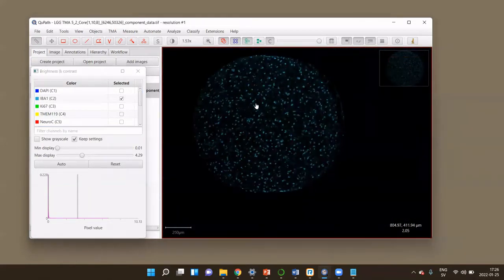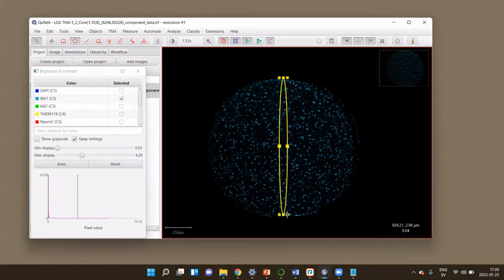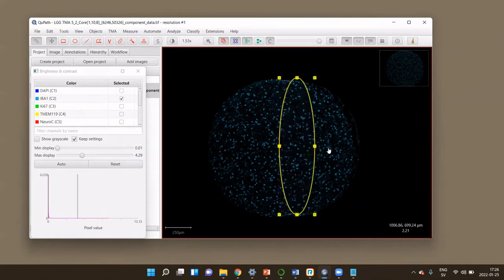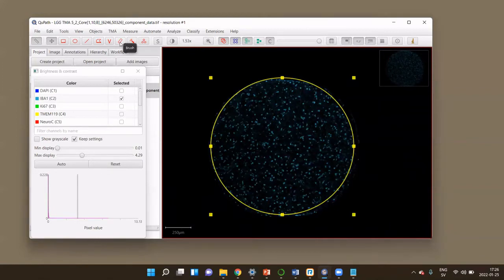In the next step, I would like to annotate an area in which I would like to detect cells. In this case, I want to simply annotate the entire core, so I can draw a circular selection annotation. But often you have tissue that is a bit destroyed or necrotic, and then you want to do more fancy annotations. Making annotations is really nice and convenient in QuPath. If you want to annotate a lot of data, you should really check out the documentation on how to easily select areas in the image.